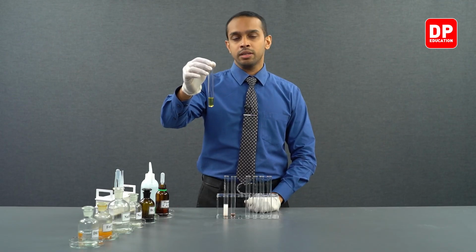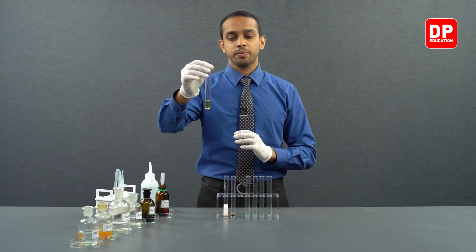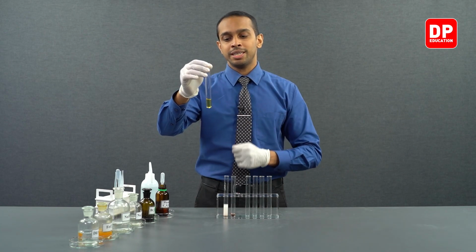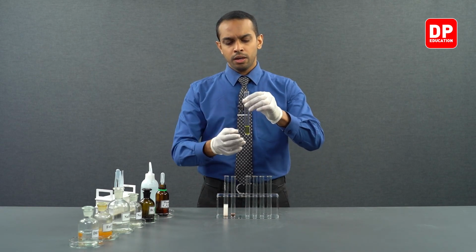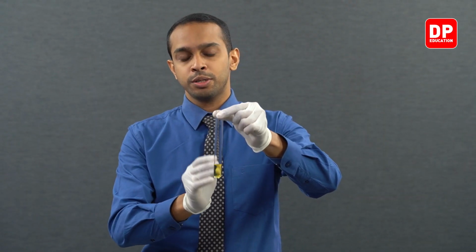If you take liquid bromine, the color of liquid bromine will be red-brown. What we have here is bromine water, and you can see a yellow color in this bromine water sample we have here.